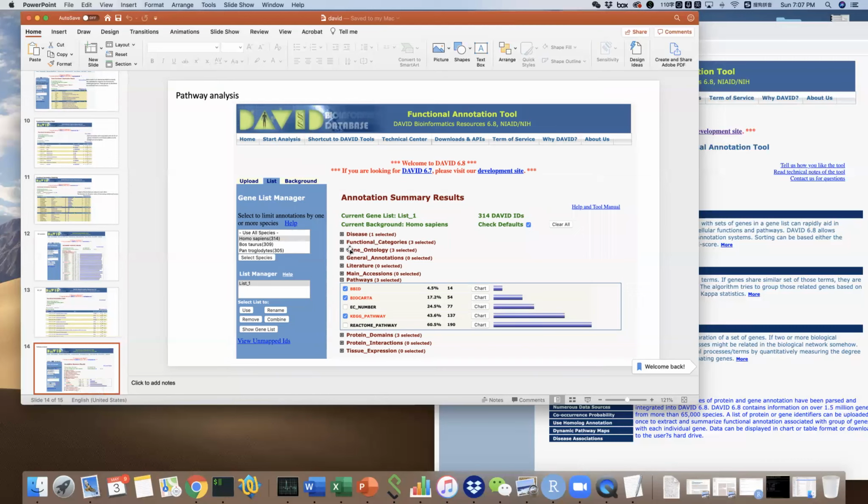After clicking the gene ontology button, there are also a couple of other buttons we can click. Among all the buttons, one important button is pathways. For pathways, DAVID mainly provides three important databases: BBID, BioCarta, and KEGG pathway. I use KEGG very often because it is a dominant pathway database widely used by researchers.